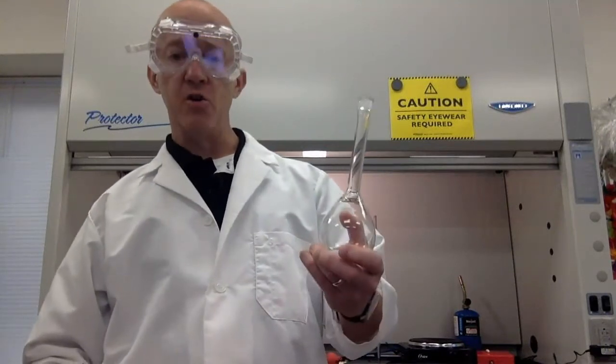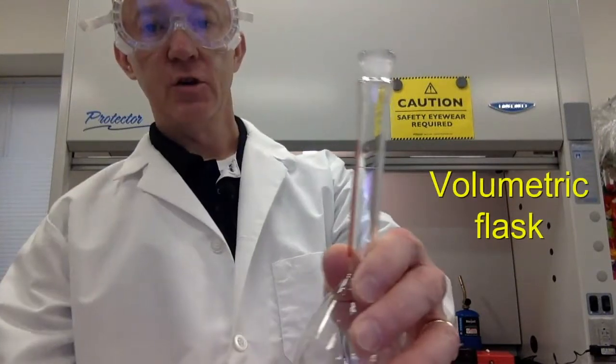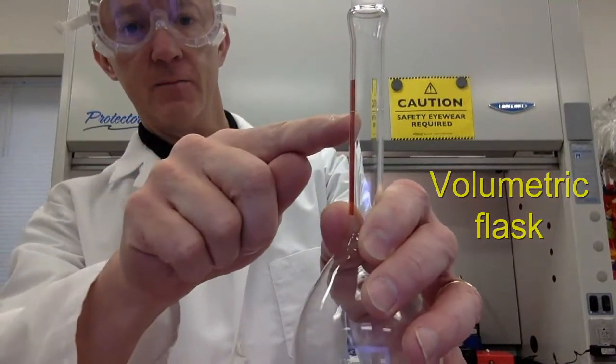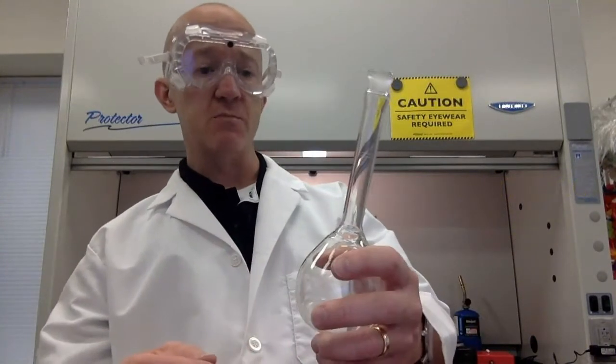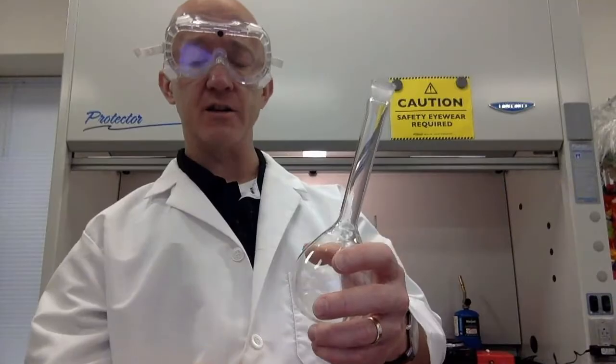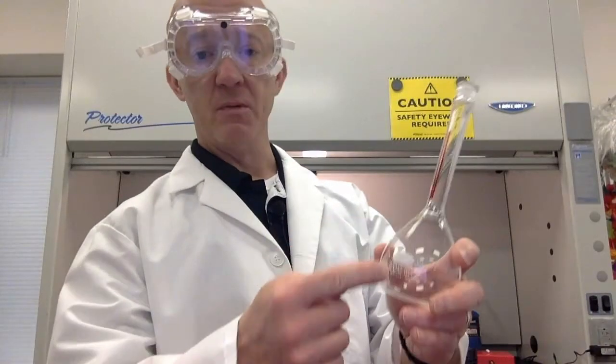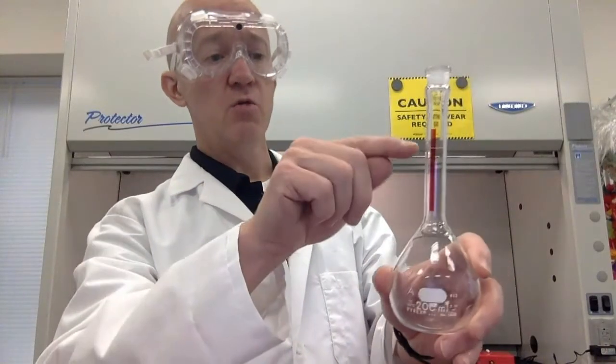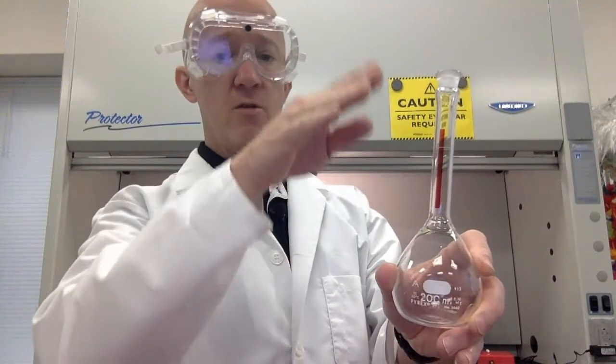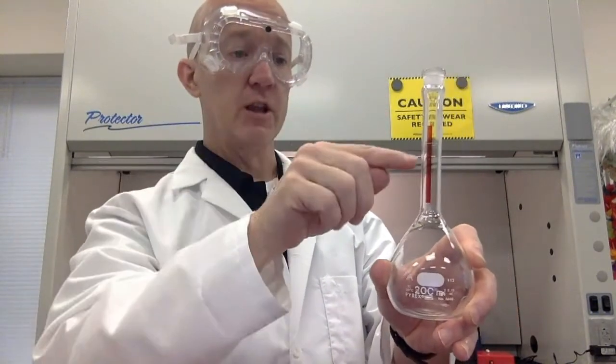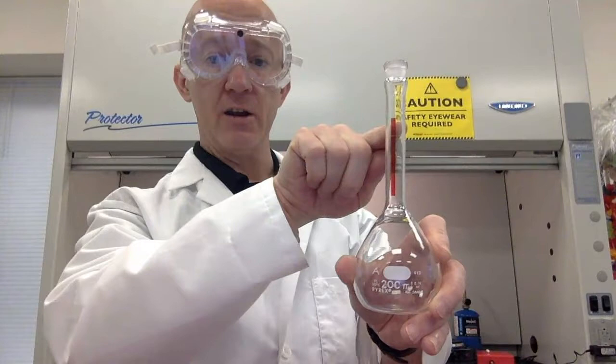This is called a volumetric flask. If you look closely, you can see a line right here. That line is used for very precise measuring of the contents within this flask. If we wanted to make 200 milliliters of solution, we would use this line and allow the curved portion of our liquid to sit right on that line. And that would give us precisely 200 milliliters in this case.